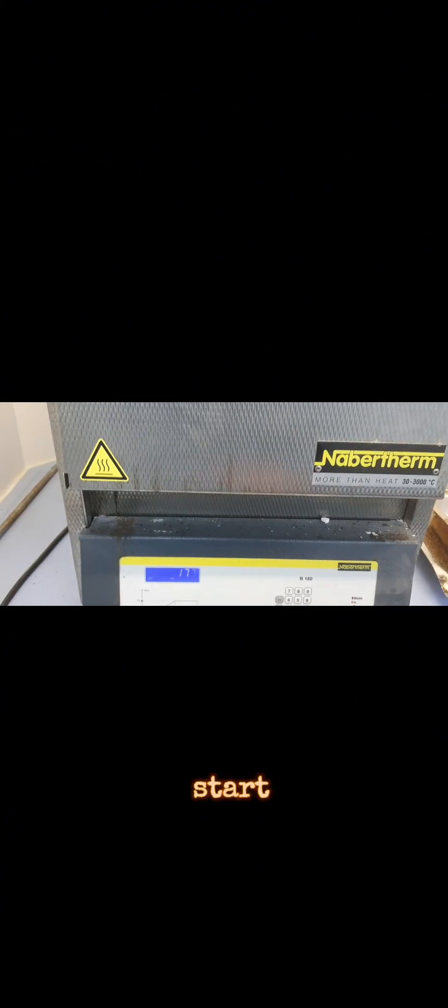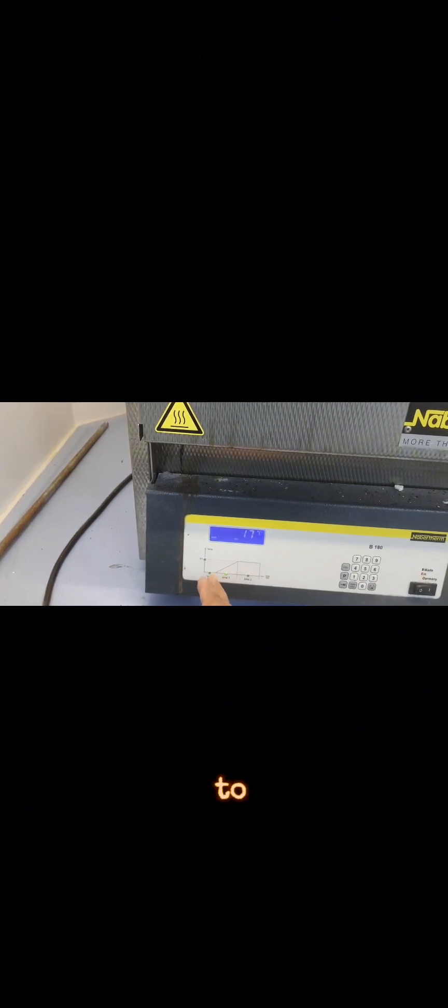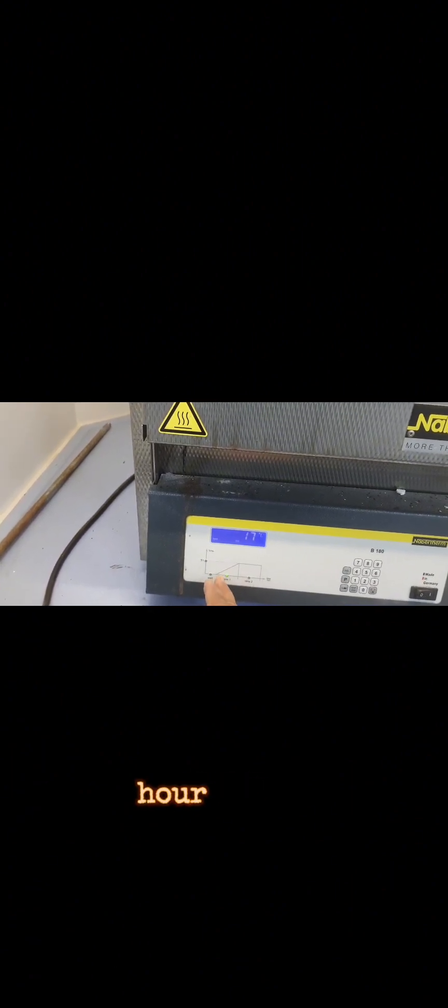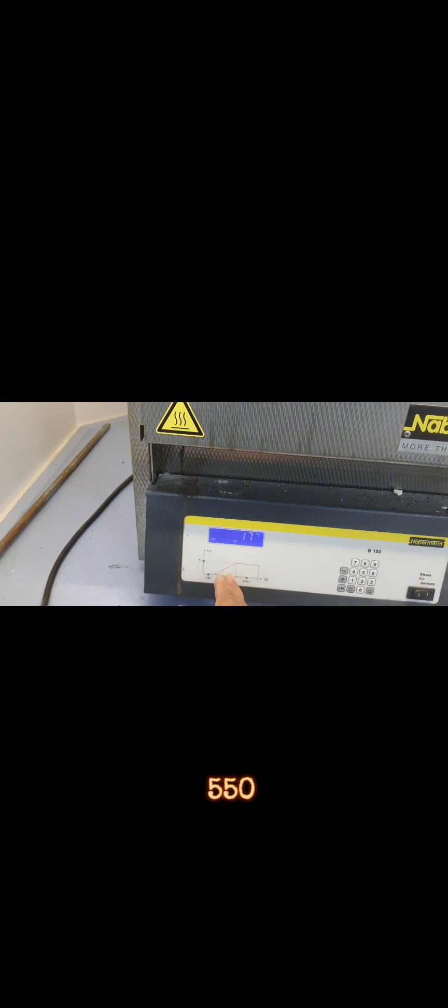Now let us close this and start. It has started so it will directly go to 550 without waiting. If I keep this time, it will take half an hour to reach 550 and then it will run for 550. This is the concept of time one and time two.